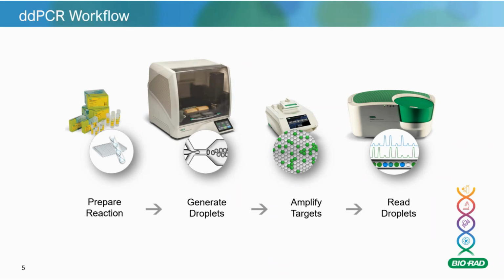Or you can do it with an automated system, and the automated system obviously just takes away the hands-on time with that sort of procedure. You just select the number of wells you want to be partitioned, and it just does the pipetting automatically.